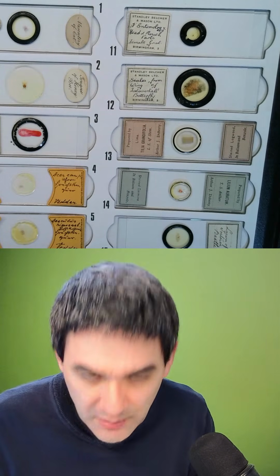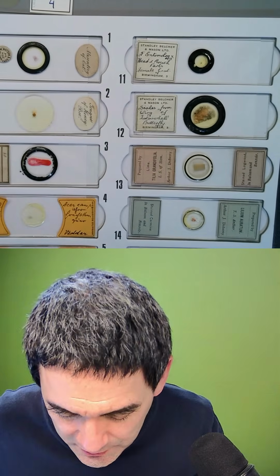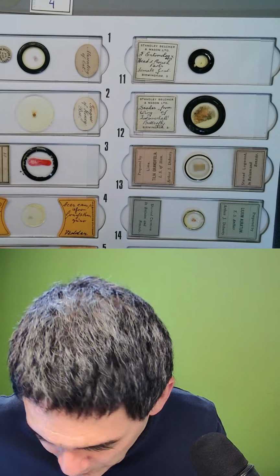One of the other things that I like about those slides is over here, for example, look at the ring. They actually used color patterns. They made it quite nice. So I got this one. I'm going to show you now a couple of interesting ones.